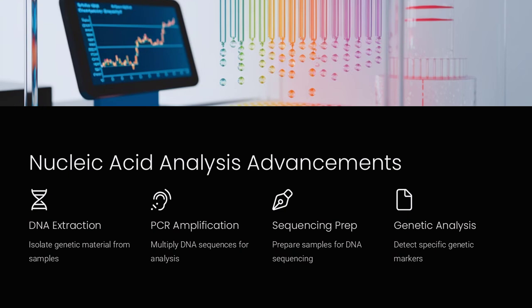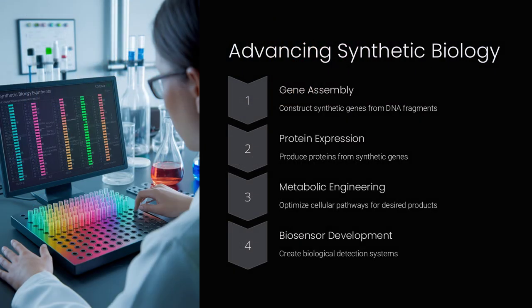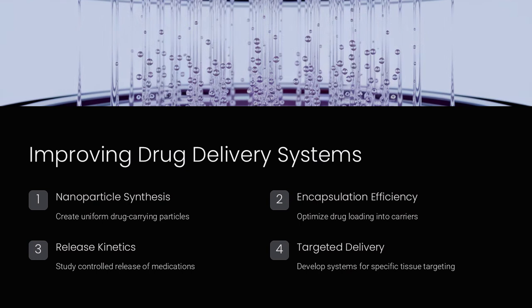The future of digital microfluidics is promising, with ongoing innovations aimed at further increasing automation and integration in laboratory workflows. Advancements are expected to improve device robustness, scalability, and user-friendliness, with integration of artificial intelligence and machine learning likely to enhance data analysis and decision-making capability. These developments will further streamline complex laboratory procedures, reducing time and costs associated with research and diagnostics, and ultimately revolutionizing lab automation by enabling smarter, faster, and more efficient workflows.